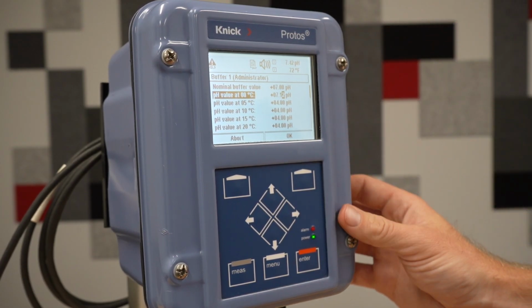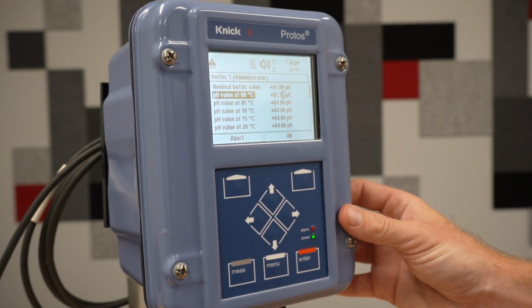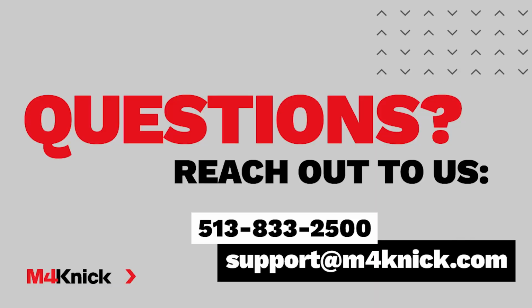We will continue until the process is completed for all 3 buffers. This concludes the video on how to activate the user-definable buffer set within the Protos 3400 transmitter.